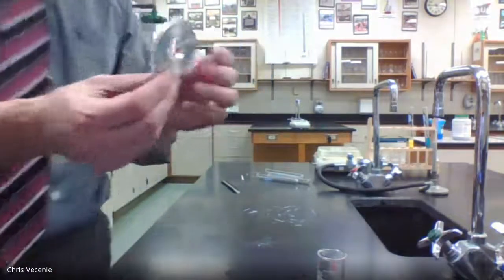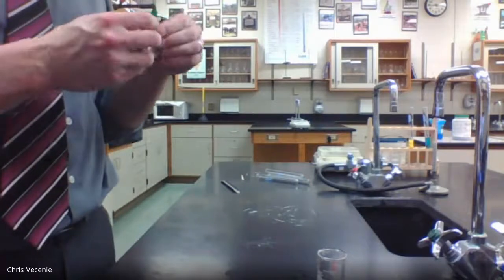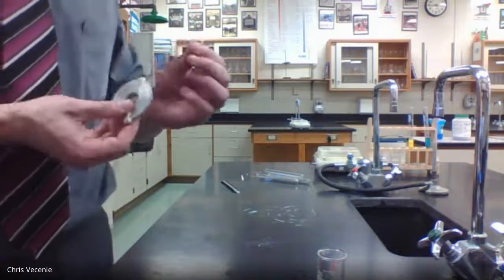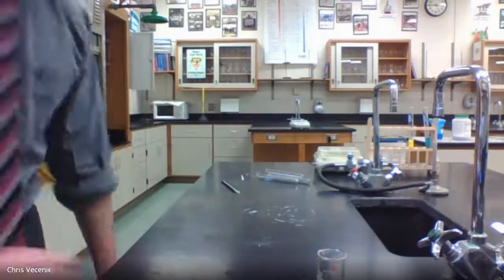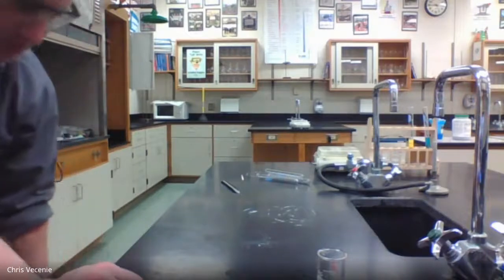And what you see here is some magnesium ribbon. With this magnesium ribbon, I am just going to cut a little piece off with a pair of scissors. Then I'm going to go in my drawer, grab myself some beaker tongs.